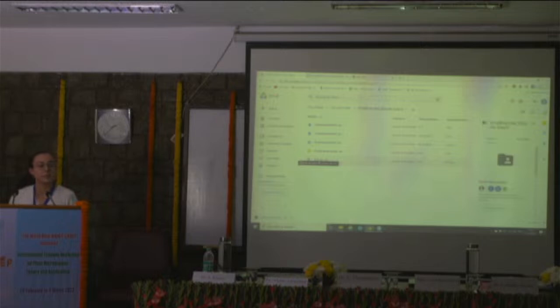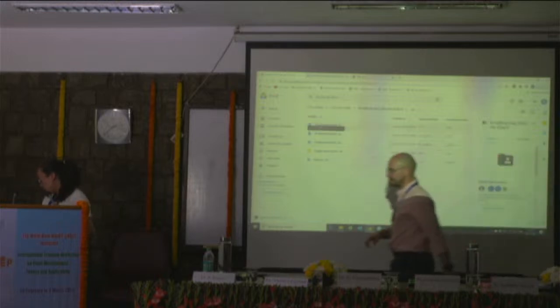So that is a comma separated file. That is basically an Excel file with data in it. You will see it. We will open it with RStudio. We do a small check to see that everybody has it. Okay. Yes, thank you. So they have to open the data. Download both of them and then put them together in a folder. Maybe in your downloads is already enough. Create maybe a folder in your desktop and just put practical R, and then you download that data.csv and a small exercise.Rmd, and then you put that file in that folder.